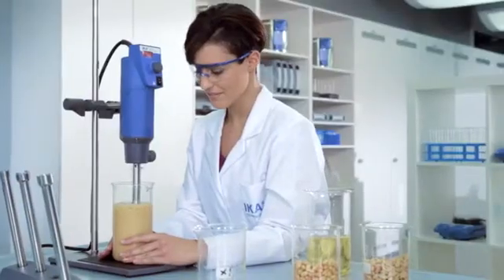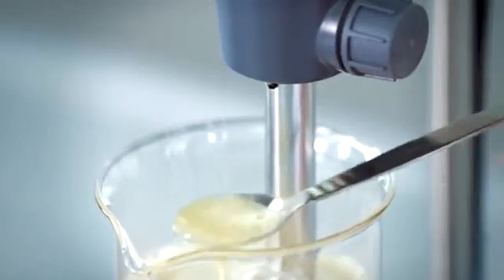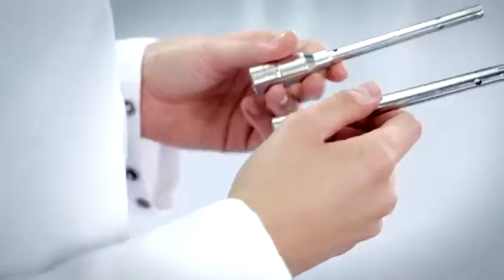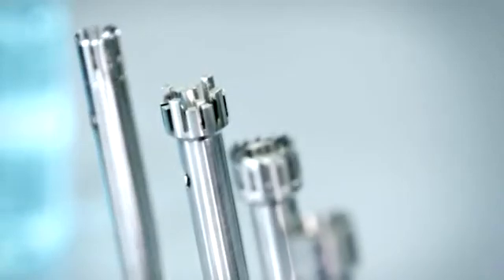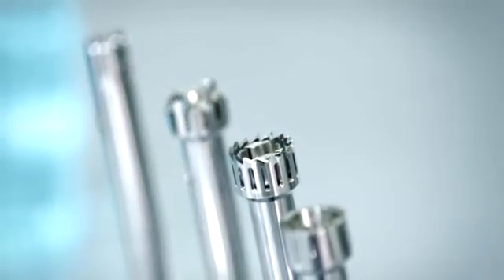Take advantage of our extensive range of special dispersing tools. The IKA interchangeable generator shaft system, providing maximum flexibility.